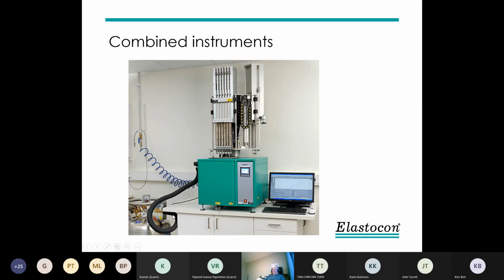So you can use other ways of cooling. One way is to use carbon dioxide ice. That goes down to -75 roughly, so it's a quite good temperature. And in the old times, you put that directly in the bath. But then you may get different temperatures in the bath, because often you had some carbon dioxide ice in the bottom, and then you get transients from the bottom to the top in temperature, and that was not good.